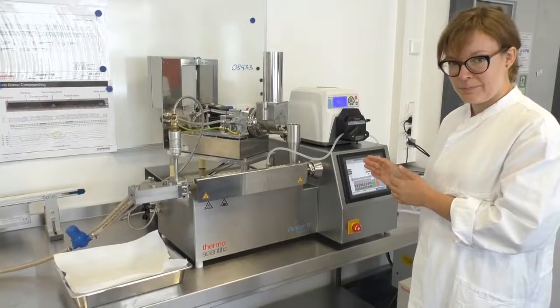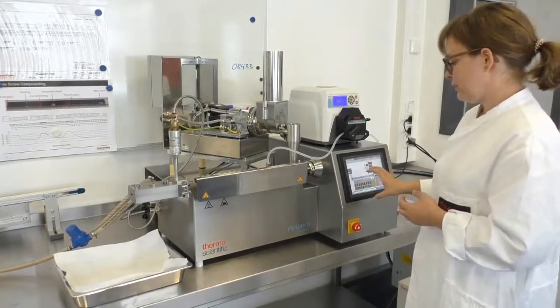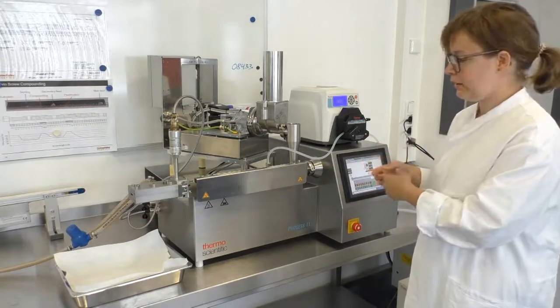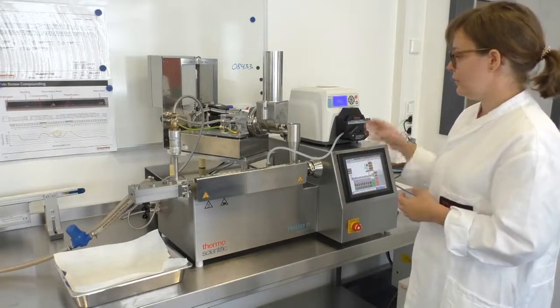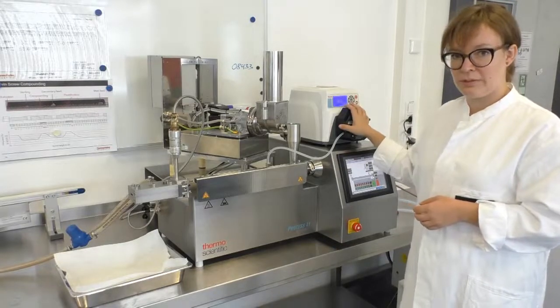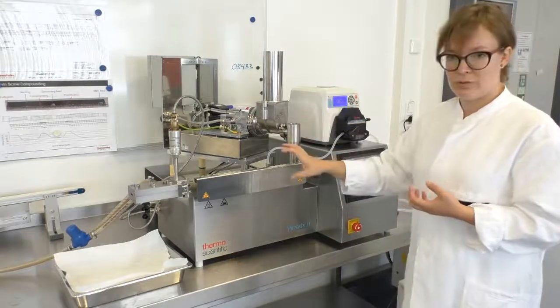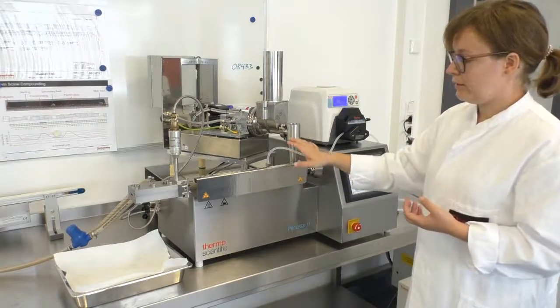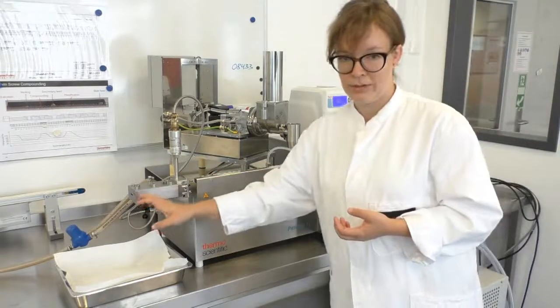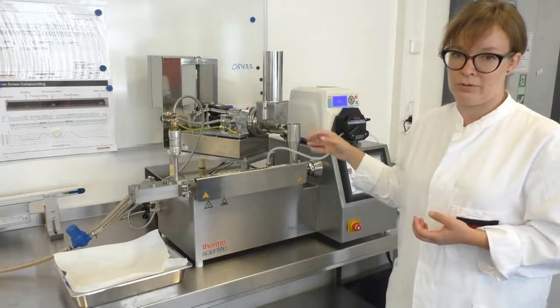As the next step, I want to start running the process. First I start the extruder by letting the screws rotate, and then the next step is that I start with the liquid feeding. It's important that we always start with the water, because this acts as a lubricant and avoids that the extruder blocks if we only feed powder. Then, after making sure that water is inside the extruder, which we see by water coming out of the die, I will turn on the gravimetric feeder and add the powder to the process.